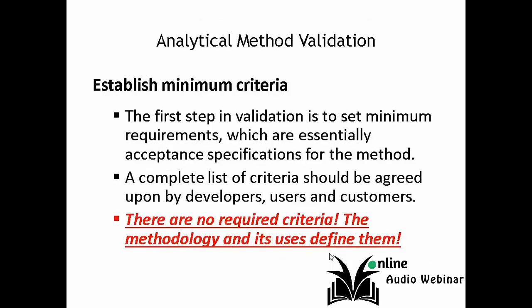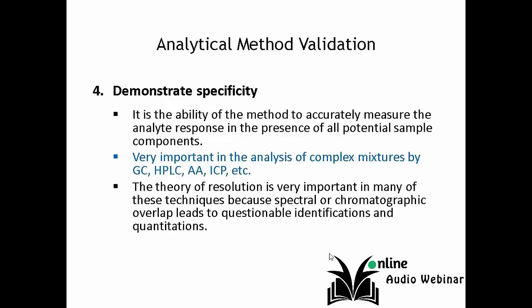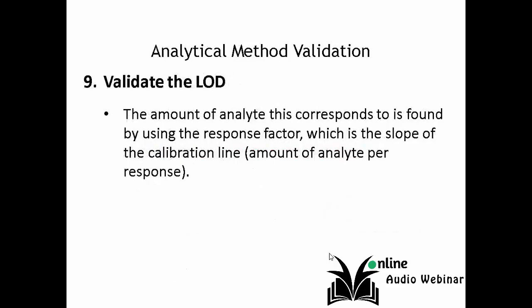Method validation characteristics, and once again, there are no lists. The endpoint describes the methodology. These are some suggested possibilities. In detail, this training was actually designed to be a longer one. I've touched on the cogent points.